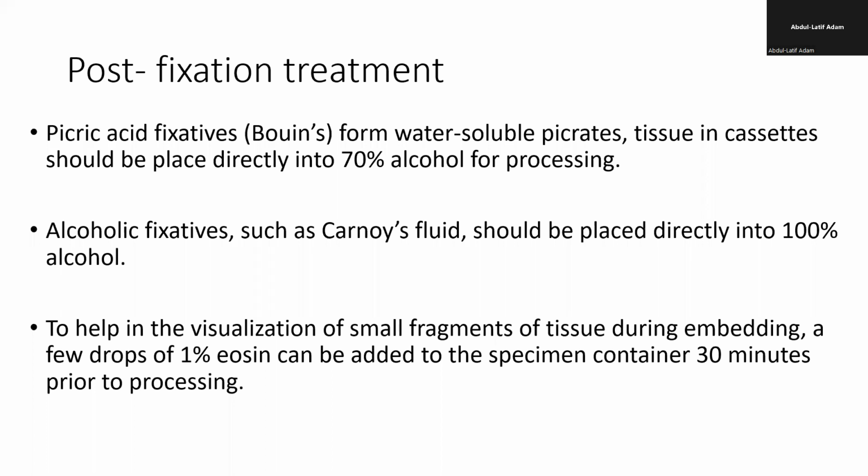Another post-fixation treatment is when the sample is fixed, especially cytology. Cytology deals with cells, but sometimes the samples come with tissue fragments or clots. And in that case, you want to preserve the structure of the cell, so you fix it in ethanol, or an ethanol-based fixative, like Carnoy's fluid. Carnoy's fluid is an ethanol-based or alcohol-based fixative.